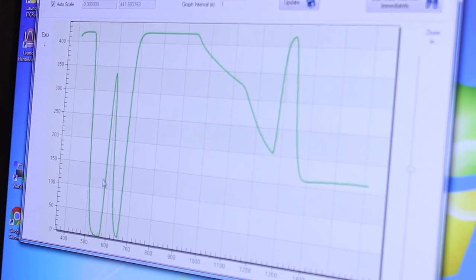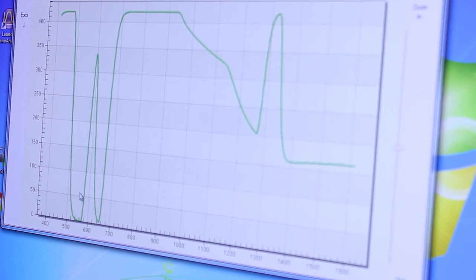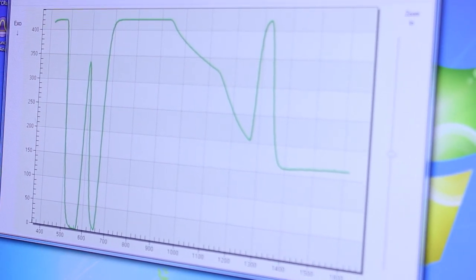We can see the baseline over time on the monitor tab.